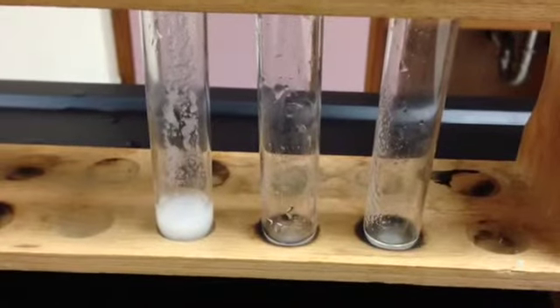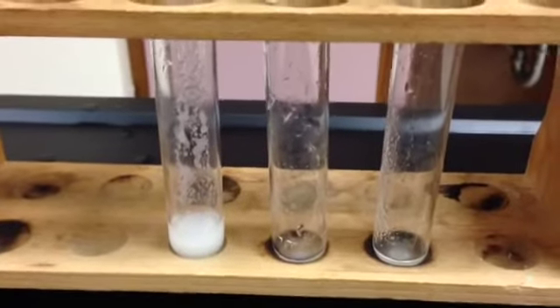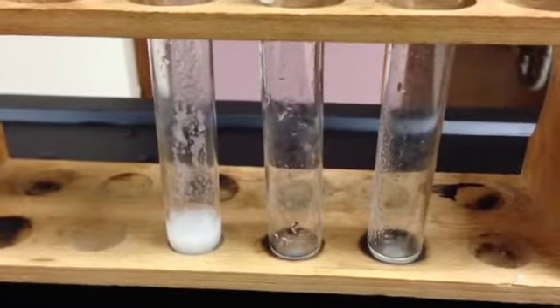When I cleaned the test tubes out, this was what was left. The one on the left, which we knew would not dissolve all the way, still has salt remaining on the bottom, unlike the last 2.